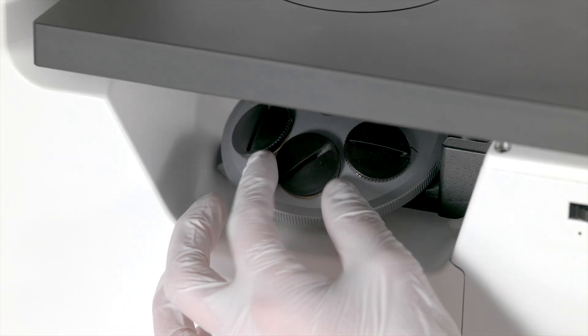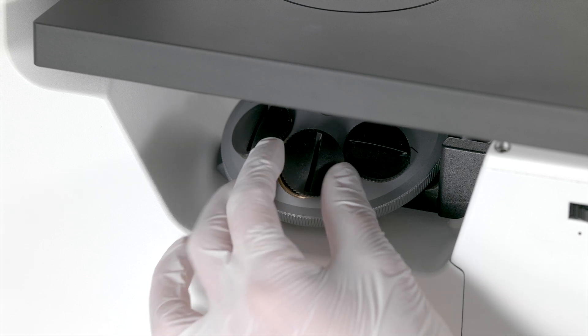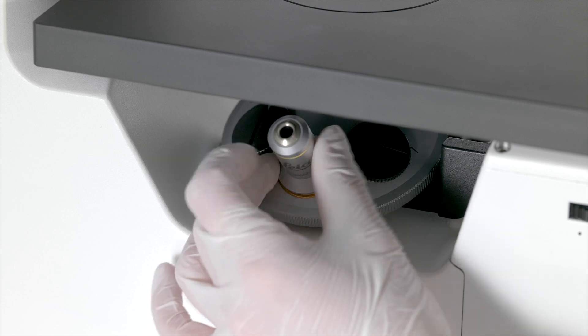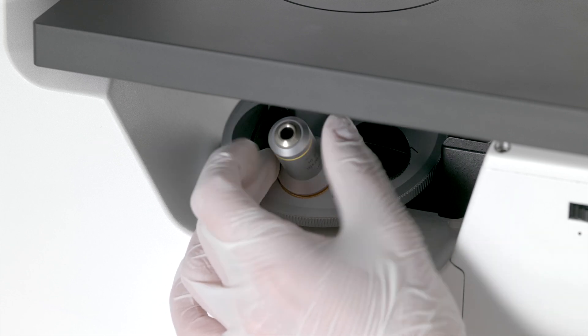To install an objective, rotate the nose piece to the position where you want the objective, remove the cover, and screw it in clockwise, taking special care not to touch the objective lens with your fingers.